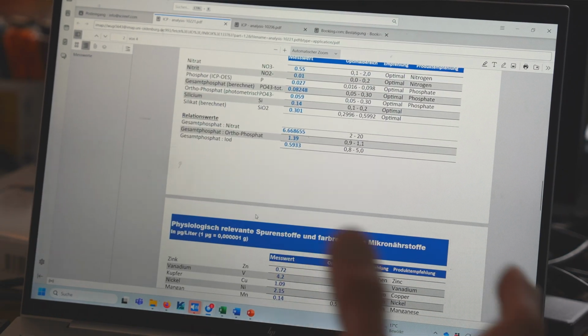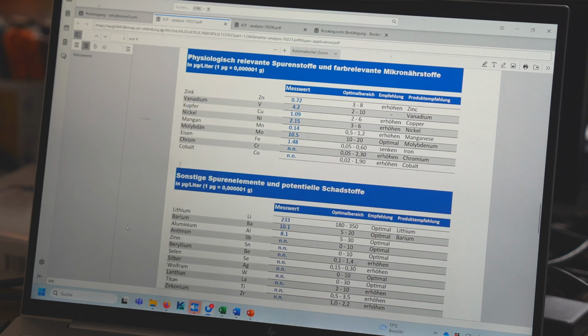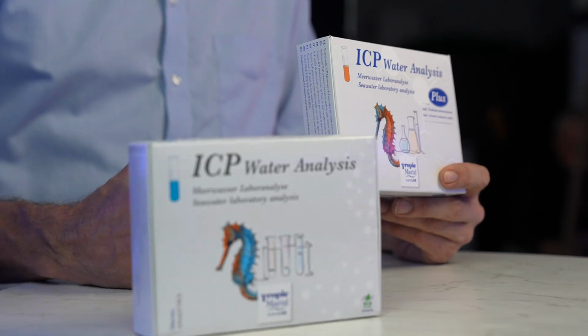That is also important, that it's in a balanced range, that you don't have super high nitrate and no phosphate, because that would be pretty bad. You get the relations from the phosphorus to iodine. That is also relevant for the coral's health. And then we have the trace metals. The way that is measured is identical to the ICP only. So you get the same data basically.